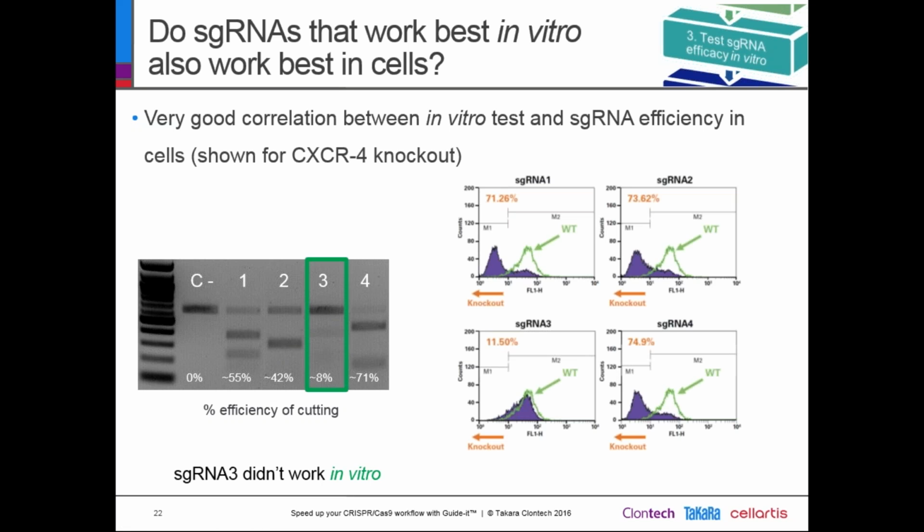So our R&D then transfected those 4 guide RNAs and also Cas9 into HeLa cells, and they used a FITC conjugated antibody against CXCR4 to monitor the surface expression of the protein. So you can see here, in case of CXCR4 expression, you will get a fluorescent signal in the flow cytometer. And what you can also see here is this leftwards shift in the cell population when transfecting guide RNA 1, 2, or 4. And this is an indication of a functional knockout of the CXCR4 protein.